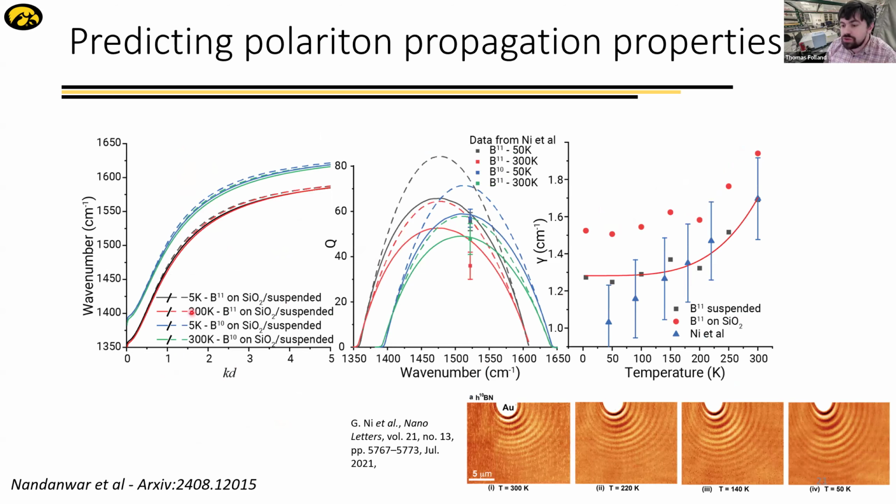And so using the data we collected, we can really meaningfully compare this against the prior work where they did the measurements of polaritons. And we find our optical constants predict, basically almost perfectly match, within the error on their measurements and the uncertainty in our measurements. They almost perfectly match what was measured for the polaritons.